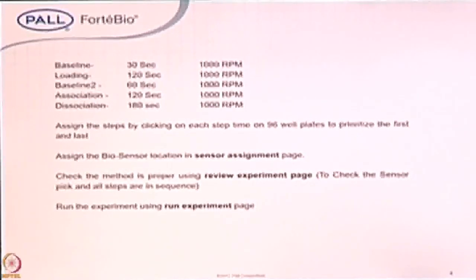This feature is not available in the case of SPR. Once you fix this time, you can't change it. But in the case of BLI technology, there is a possibility that you can play around with the timings.